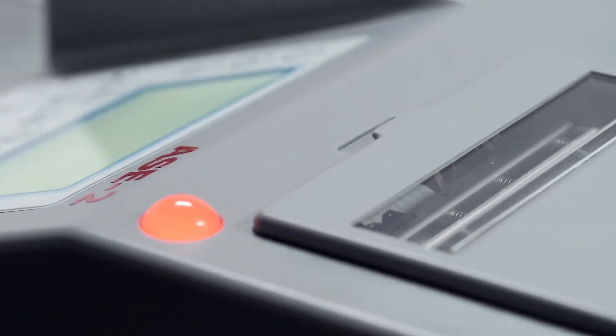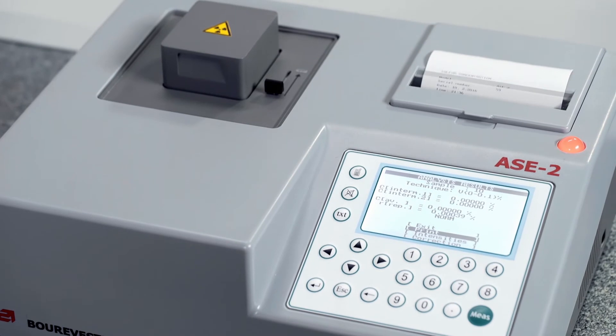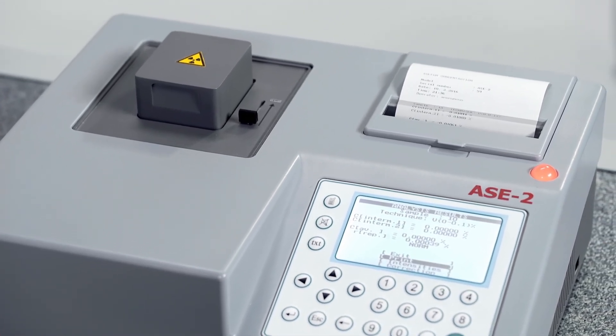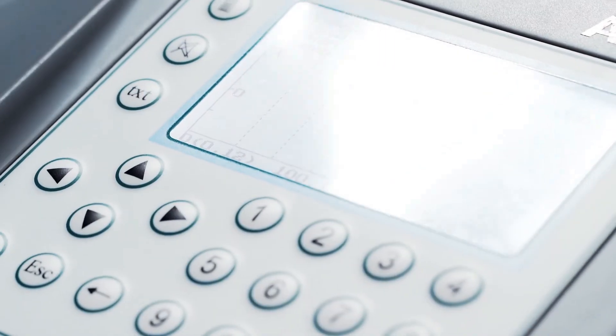The analyzer is safe for staff and protected by an interlocking system preventing X-ray radiation emissions. The smart interface makes the unit easy to operate. The measurement technique is selected automatically, and an audio signal is given upon completion of measurement.